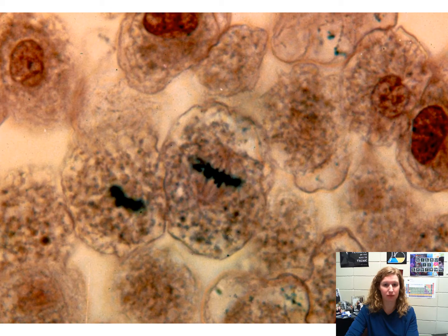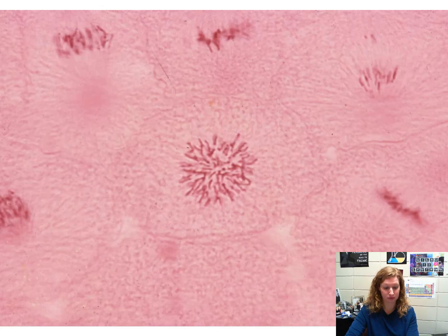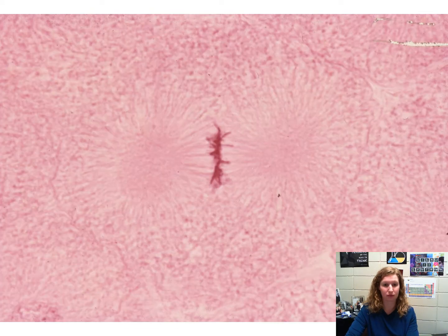Metaphase. This is metaphase, it says on there. Metaphase here in the top and also on the right. In the middle is prophase. Metaphase.